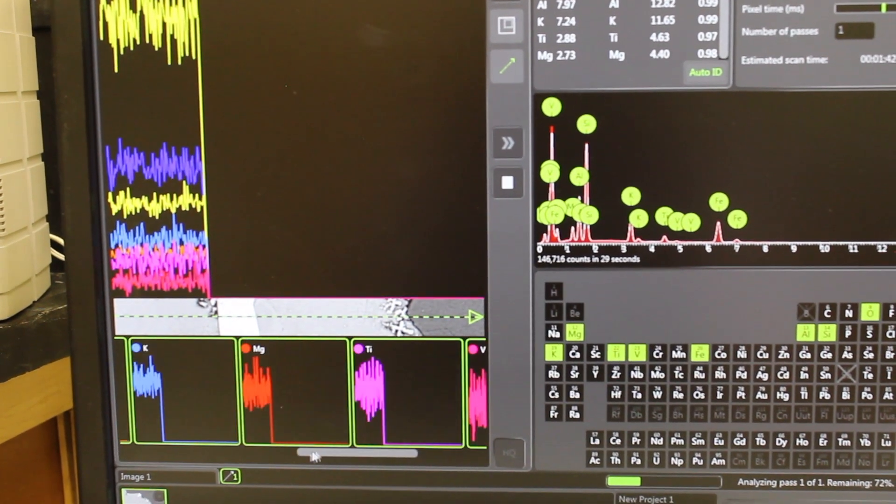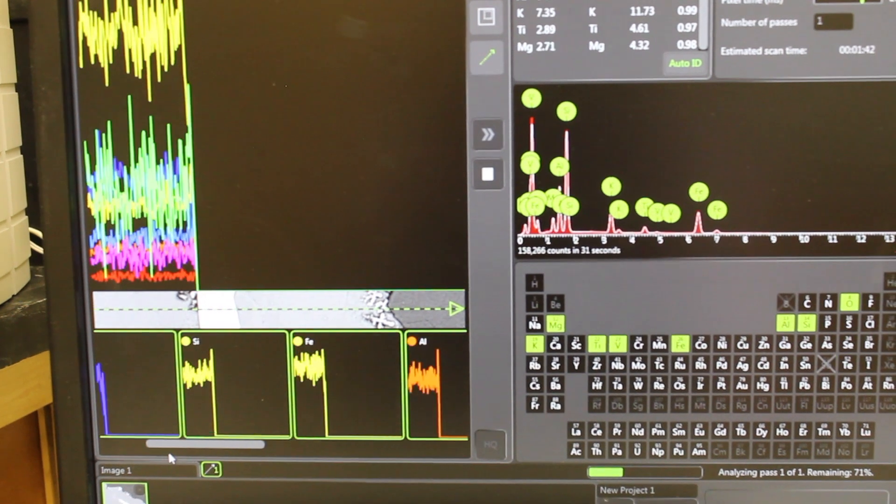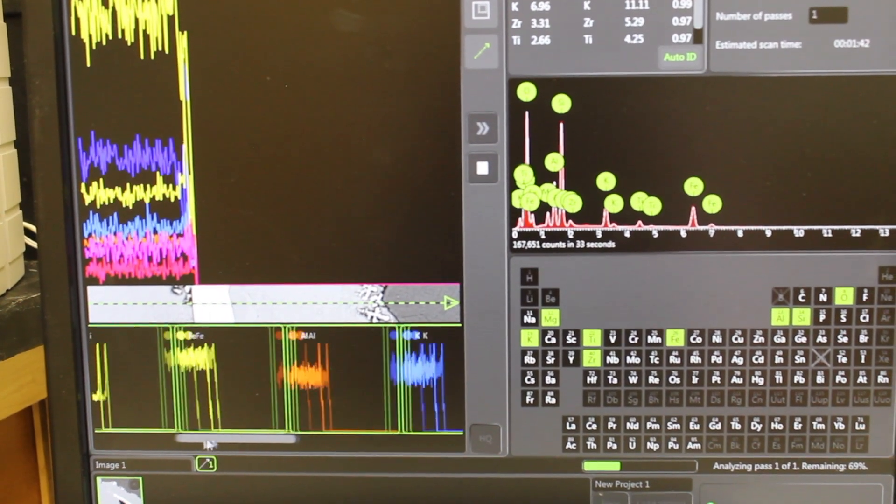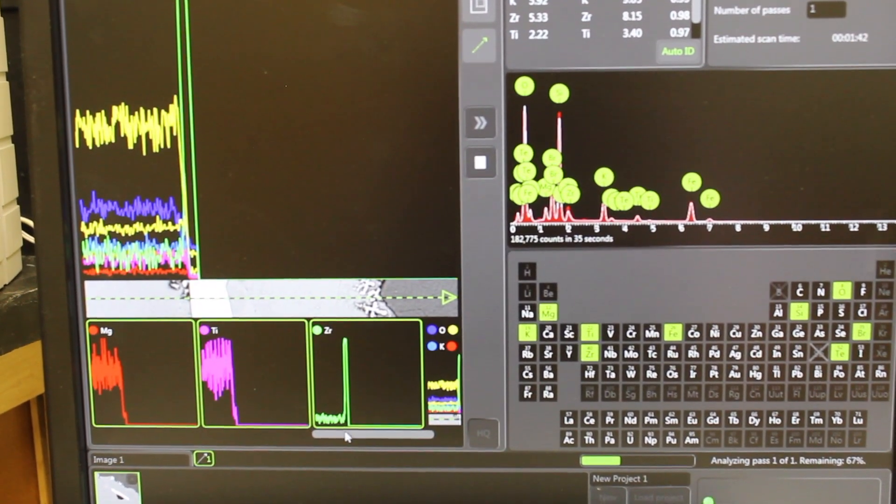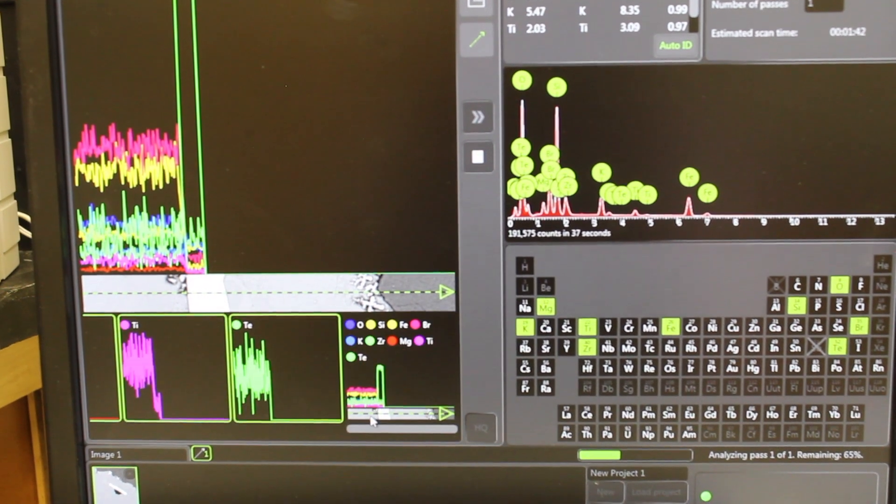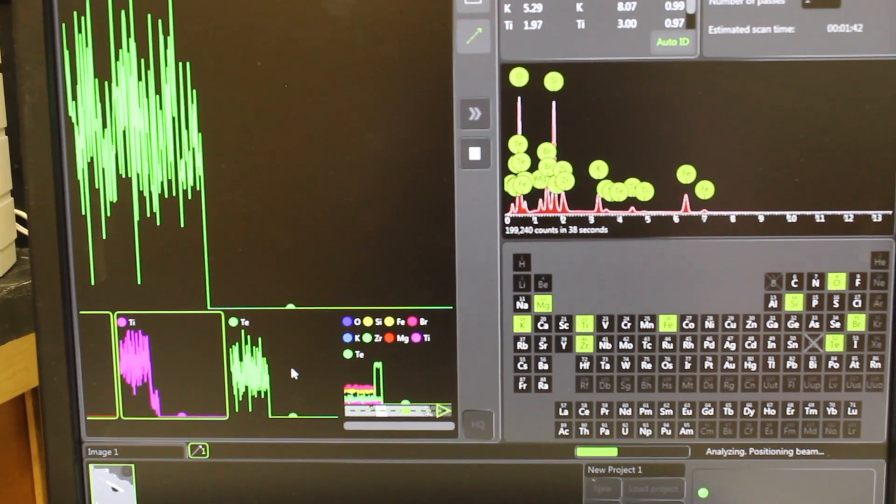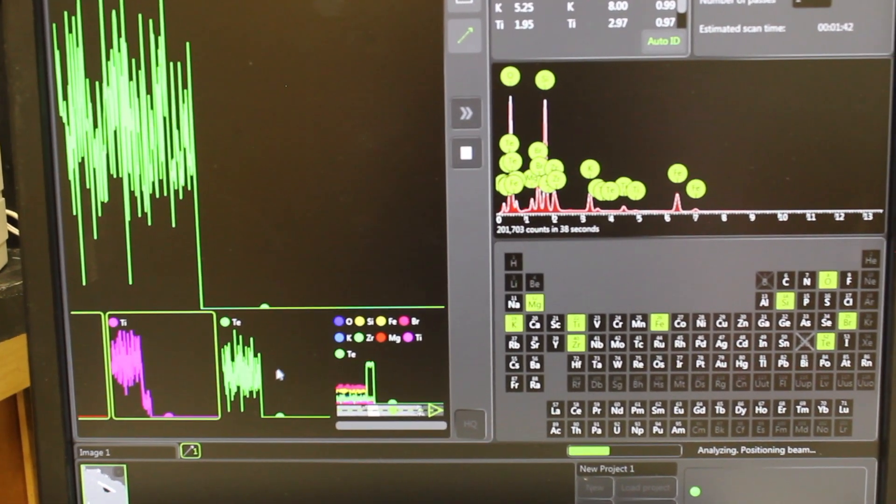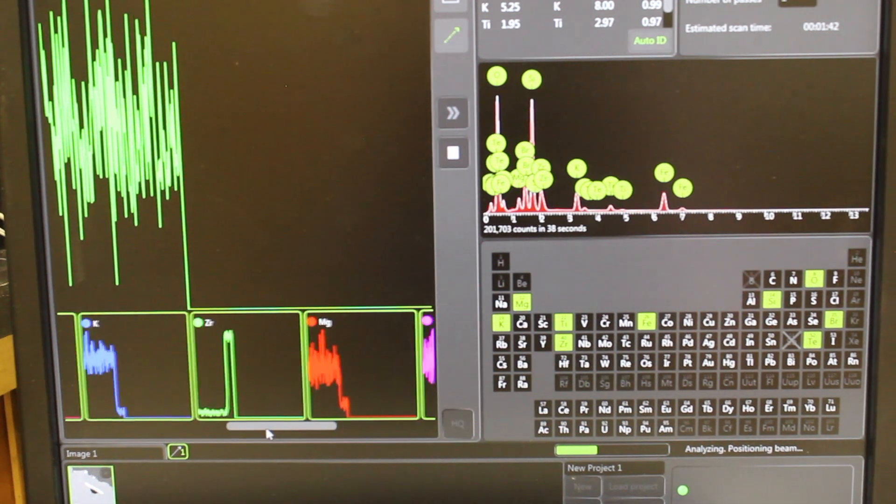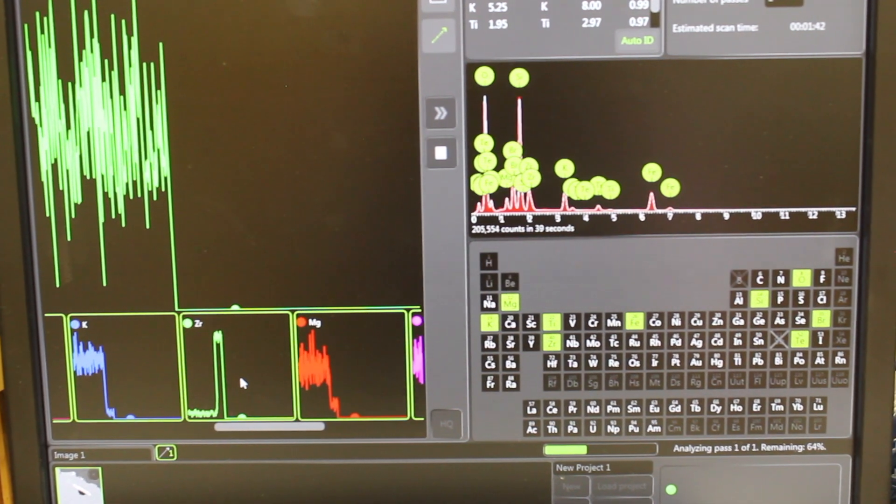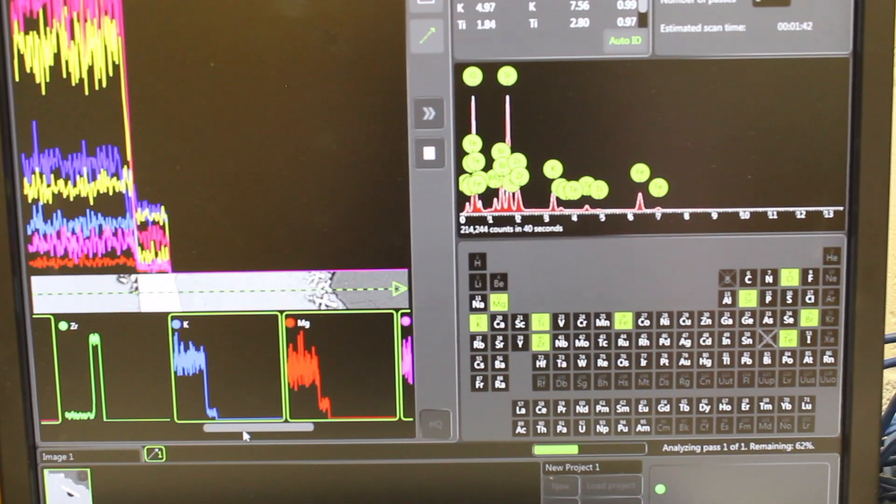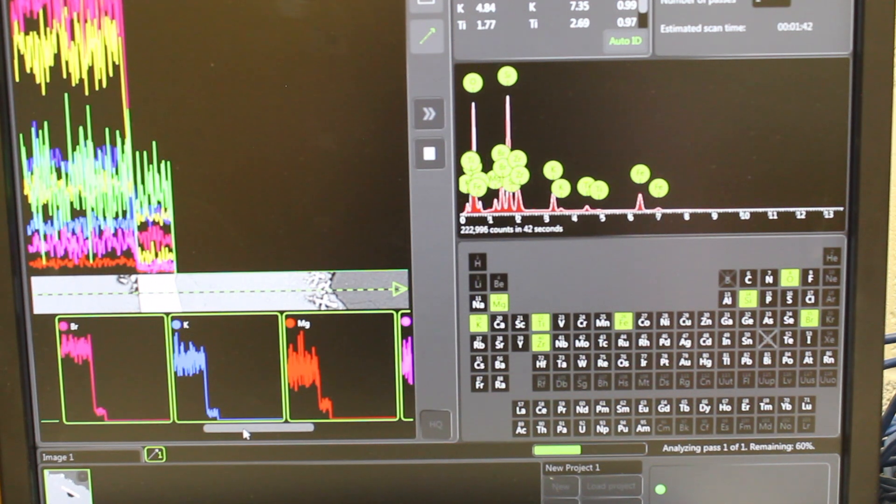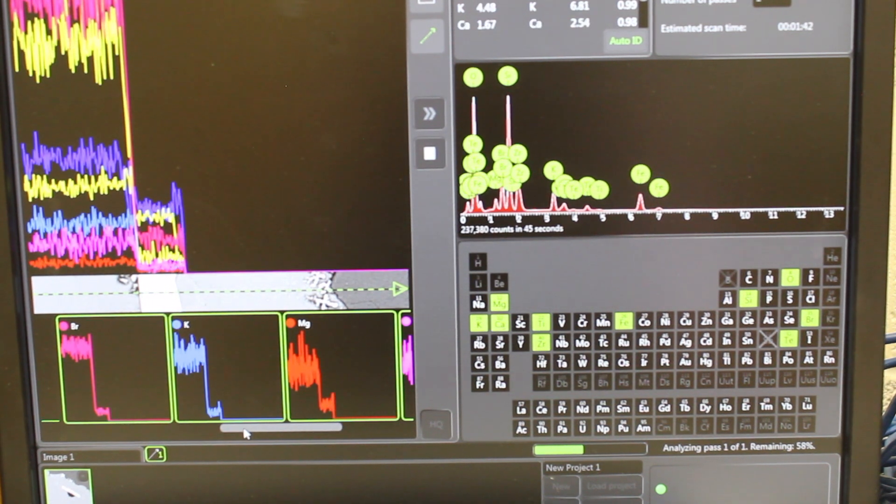And so you can scroll back and forth and choose which elements you want to map or not map. So if I'm not really interested in tellurium again, because I don't think it's there, I can uncheck it. If I am interested in zircon, because there's a zircon in zirconium there, then I want to check that.